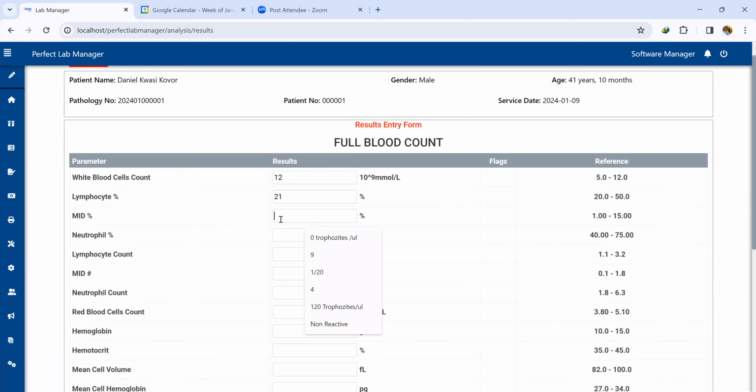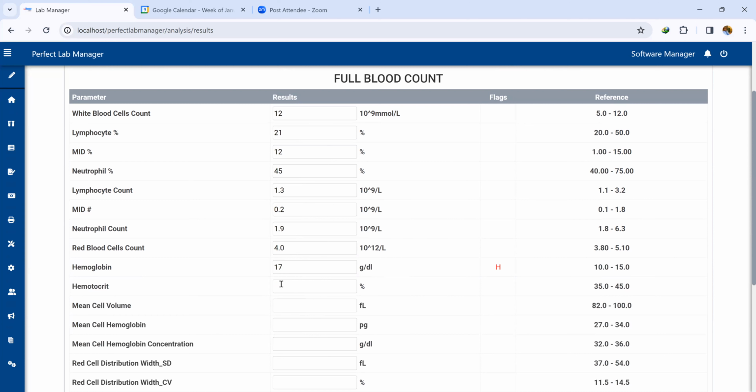We have within the range, it won't flag. We're adding this test randomly. So we're putting in test values, potentially putting this to flag, and then we put this also to flag.